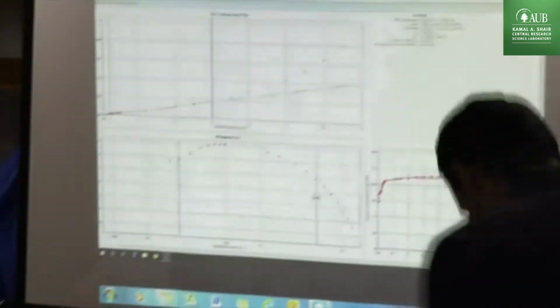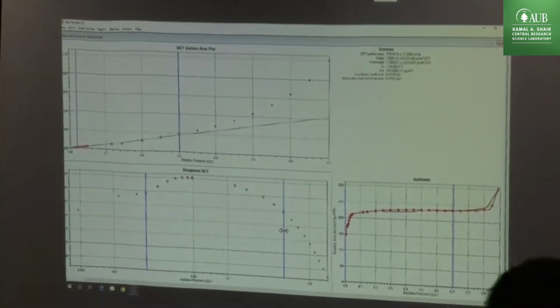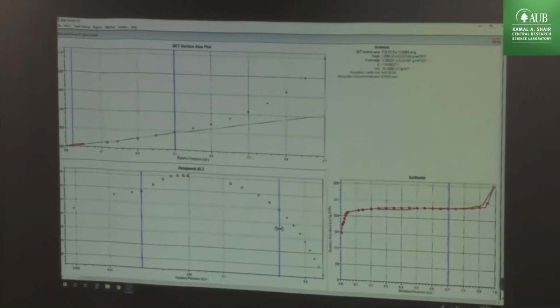It will adjust automatically, give the best fitting, which should be easy. Okay, start moving the limits until you get the best fitting, 0.9999. In this case, our C value is negative. Remember what I told you yesterday? The C value should not be negative. It means that we have a big error on the scale here.